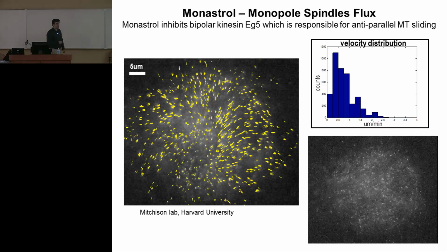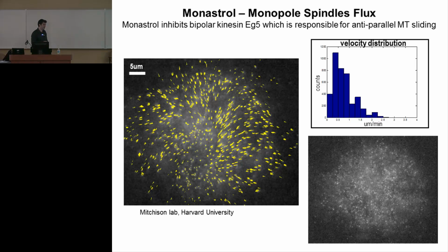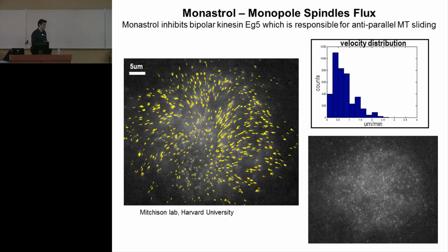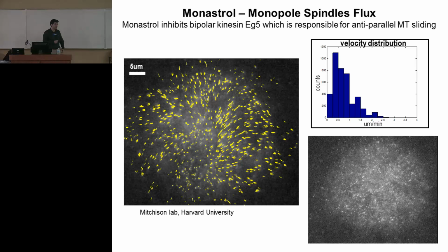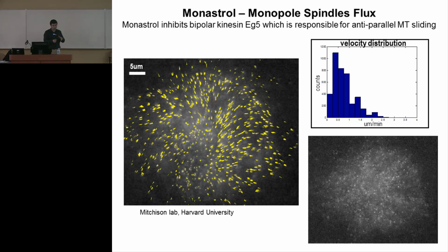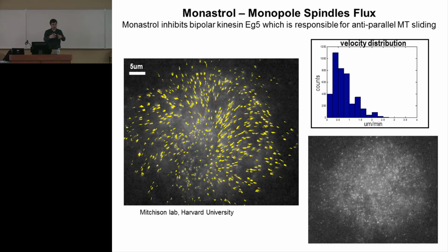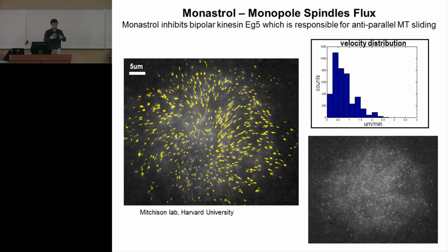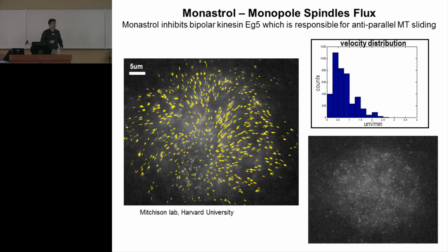I don't understand the question. I mean, if there are 100 points in the video, is it going to be the same 100 points in all the frames? No. They last for like 3-4 frames. They constantly appear and disappear. The one thing in common is that we have this translocation of the polymer. So we have the motion, but the participants are appearing and disappearing all the time. I use them for 3 frames.